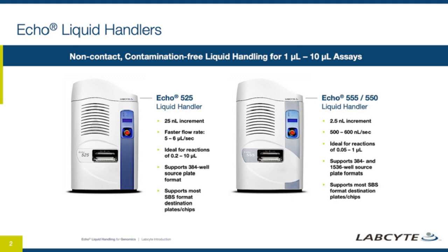The Echo 525 produces 25 nanoliter increment droplets, and we can transfer 200 to 400 droplets per second, resulting in about 5 to 6 microliters. With the 555 and 550, those are 2.5 nanoliter increments, transferring at a similar but faster rate, to a total of 500 to 600 nanoliters per second. These instruments differ mainly on that flow rate. Depending on your uses and applications, you may choose one over the other.